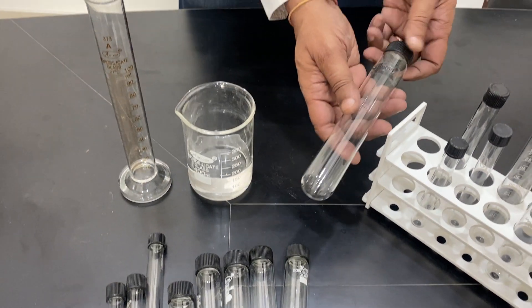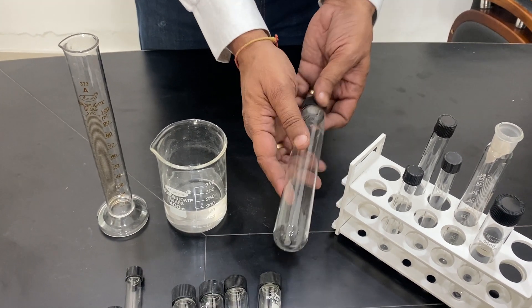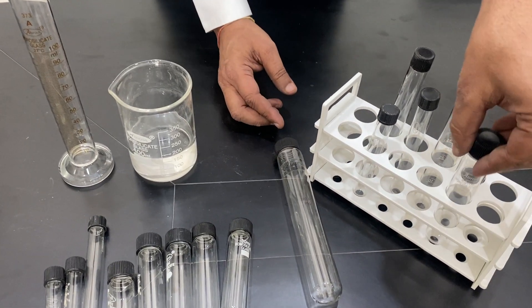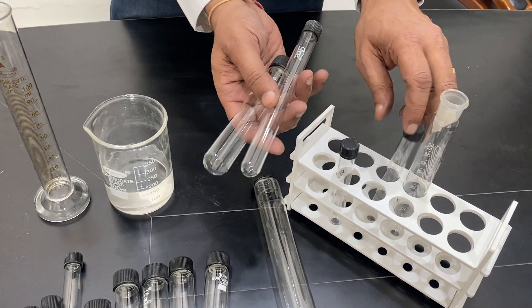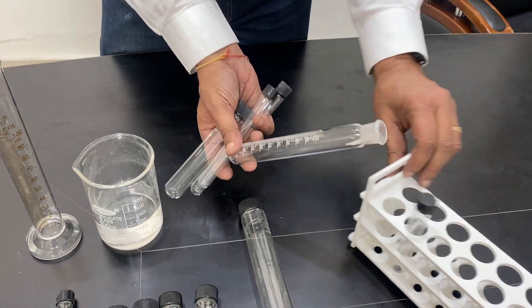There are bigger ones — about 100 ml capacity. This is a 100 ml capacity test tube, sometimes called a test tube with a screw cap, sometimes called a culture tube with a screw cap. These are culture tubes of 45 ml. Then there are 20 ml, 30 ml, and 5 ml sizes as well.